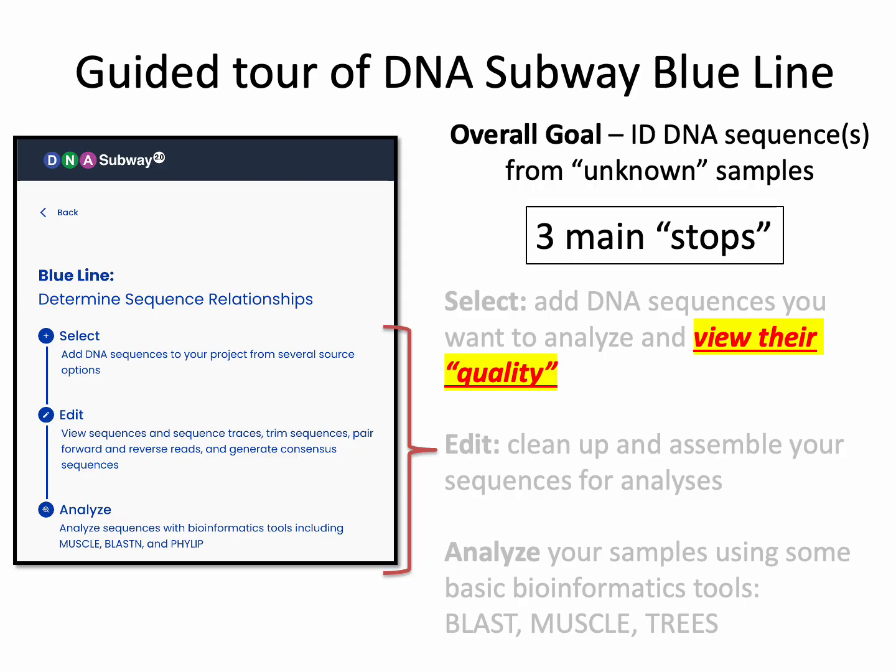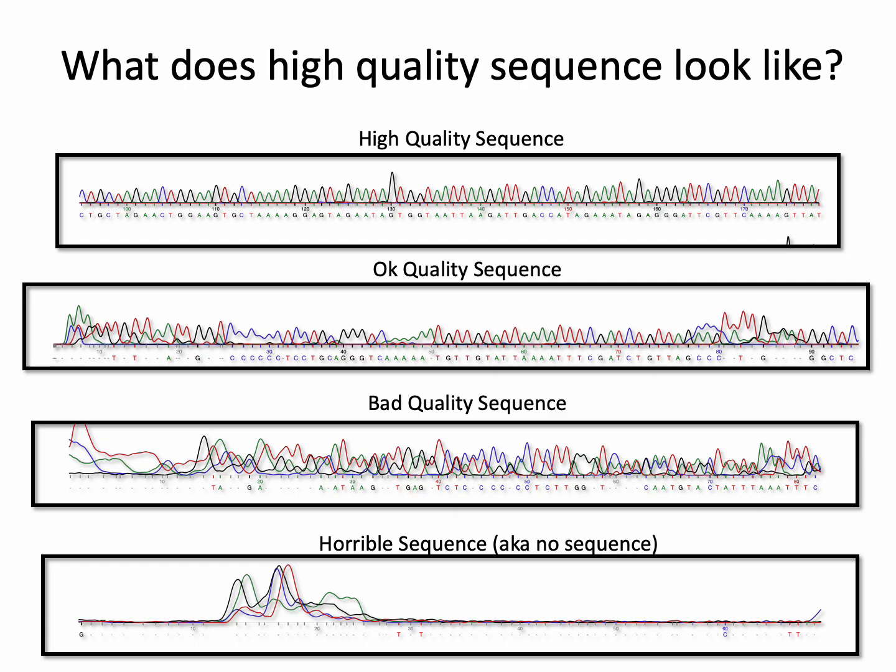So now let's talk about how to view the quality of each of your individual reads. First, let's talk about what high quality sequence looks like.